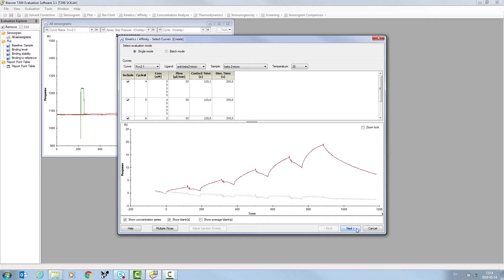In the Kinetics & Affinity window, select the Evaluation mode. In this case, Single mode is selected, and the two blank cycles are displayed in grey and the sample cycle in red.